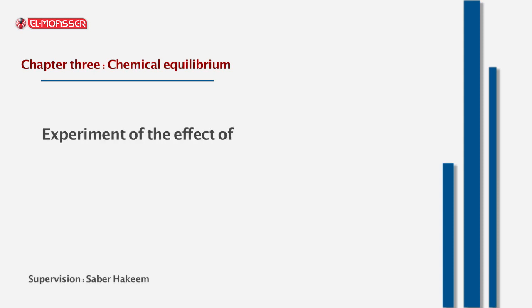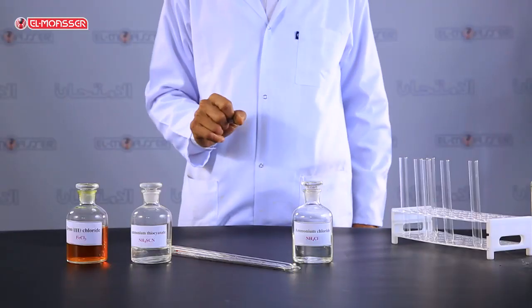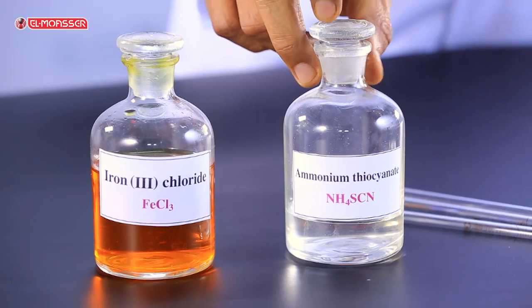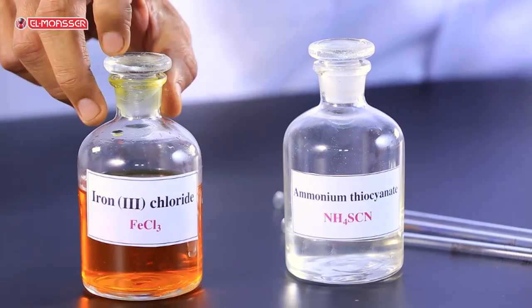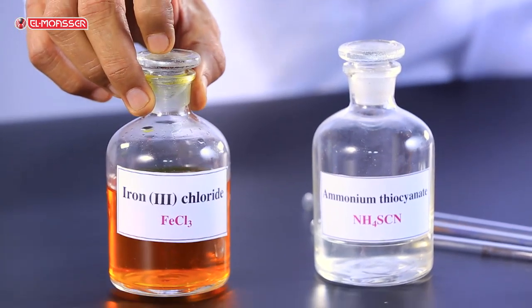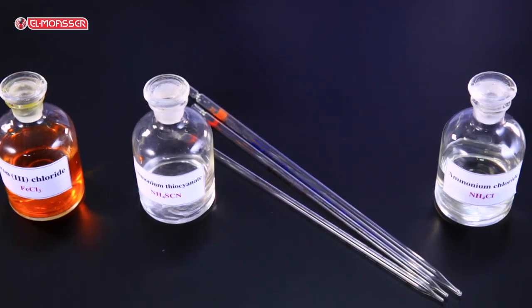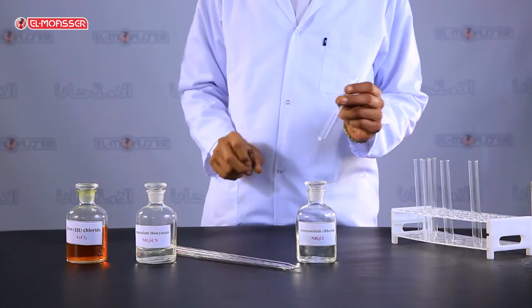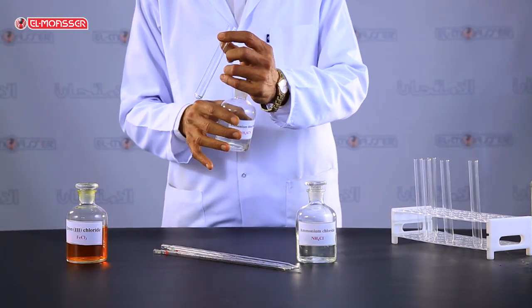Experiment of the effect of concentration of reactants on the equilibrium of a reversible reaction. The reaction of colorless ammonium thiocyanate with pale yellow iron(III) chloride is one of the reversible reactions that can be used to clarify the effect of changing concentration of reactants on the equilibrium of the reaction.